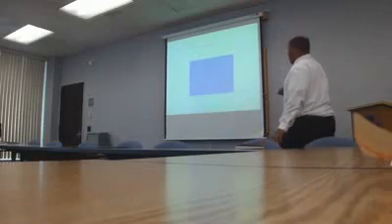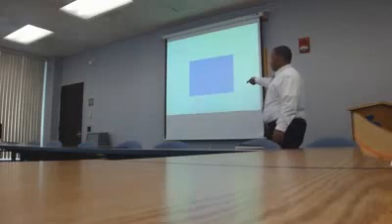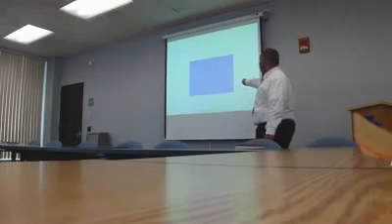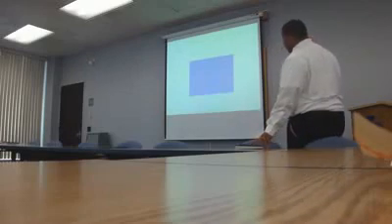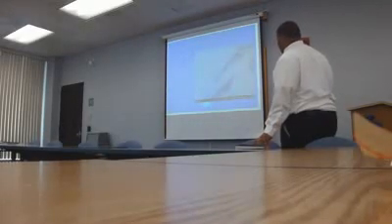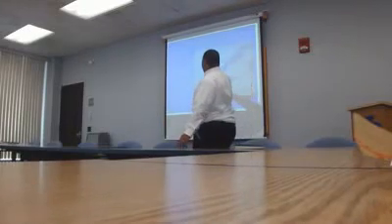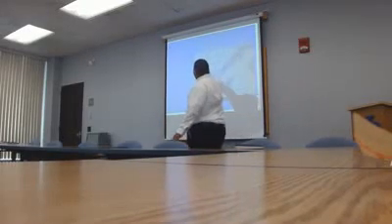Right here, 50x. If you notice, as you go closer, the image becomes better to see. But it's still hard to see because it's almost invisible. But there's a thin piece right there. Then this is a piece at 100x. Basically, this is identifying graphene. Right here is the graphite below the graphene, and you can see small pieces like this, like the tell.